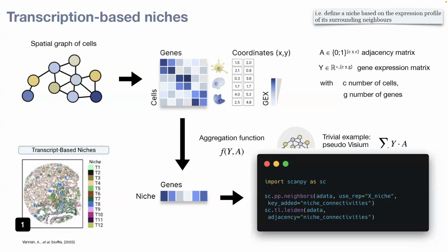If you want to have a heavily impacted self-confounding niche, sounds complex, basically a niche that's really influenced by the index cell, then you might include the self-connectivity. There are two options. You see the parameter exposed, maybe also Francesca can show it in the practical, where you add the self-connectivity. It's a matter of picking basically what you prefer.